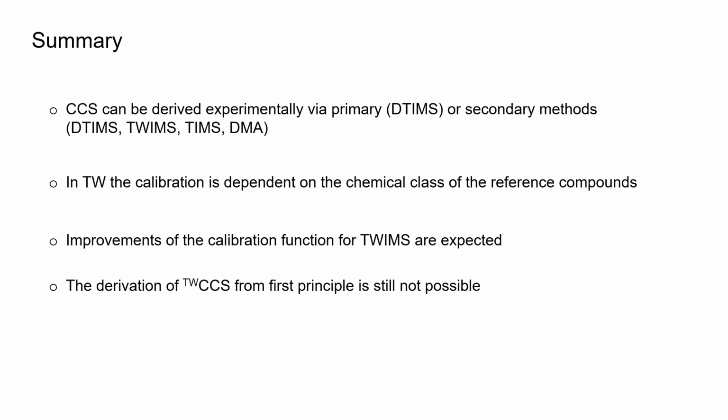And finally, the derivation of traveling wave CCS from first principles is still not possible, although some progress has been made, and maybe one day we might assist to the development of a physical equation similar to the fundamental low field ion mobility equation that can be applied to traveling wave, and maybe taking into account the velocity relaxation, anharmonic correction to waveforms, high field effects, wave stepping, and off-axis ions. We never know.